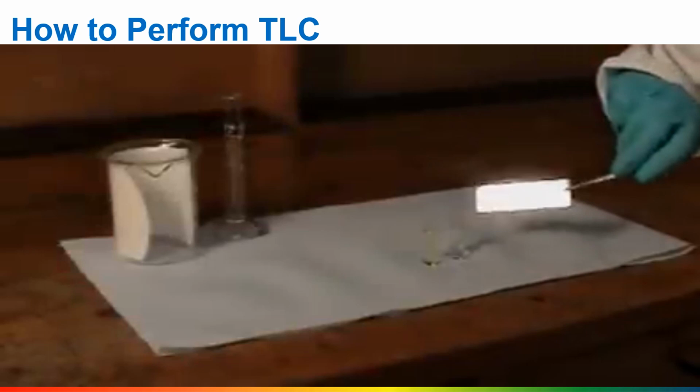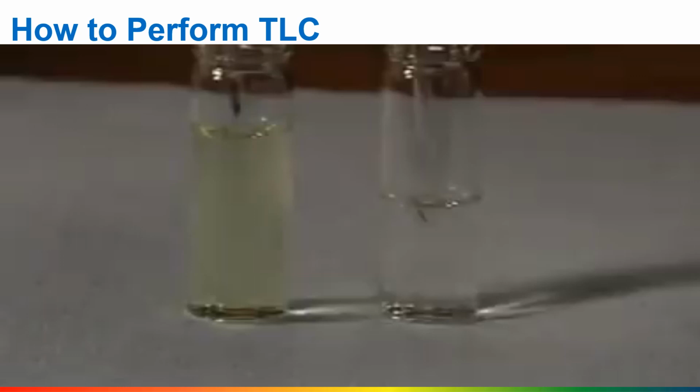We're going to use some silica which has been sprayed onto an aluminium sheet. This is called a TLC plate. We use the properties of the silica and the properties of a solvent to draw the compounds up the plate at differing rates depending on the characteristics of the compound.